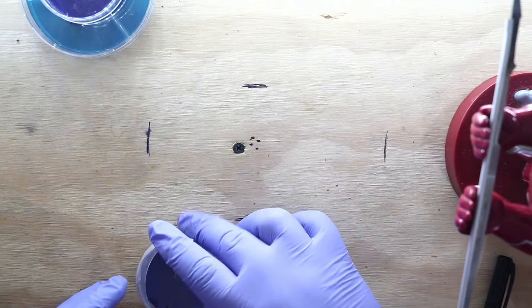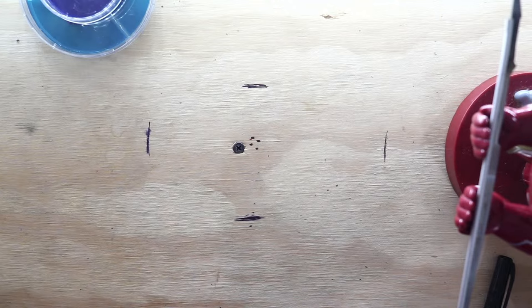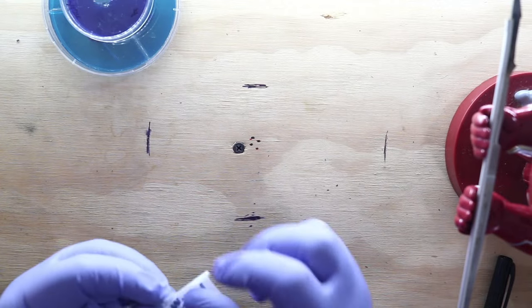Actually, I have liquid culture here specifically just to do a quality control, an LC test for you guys, just so you can see what we do. We do LC testing on pretty much every batch of liquid culture that runs out of this facility.